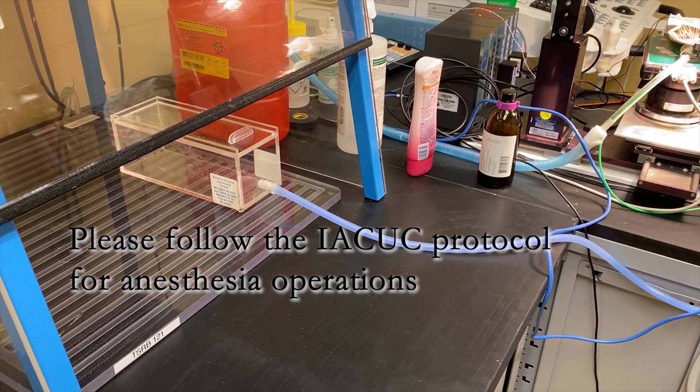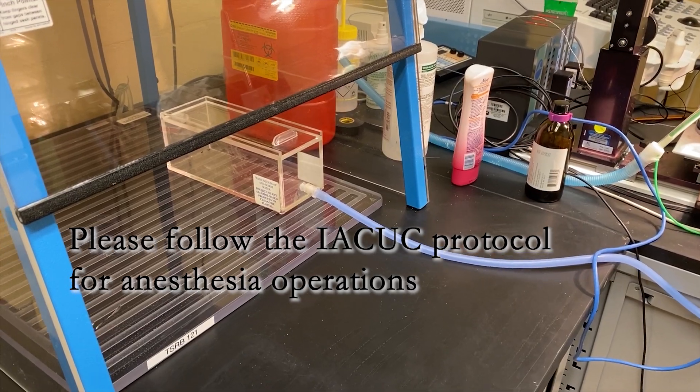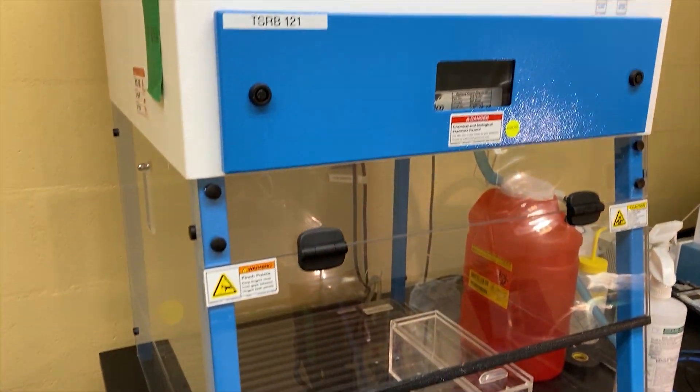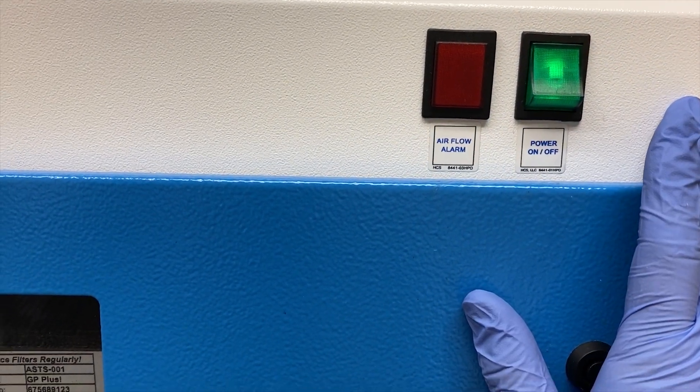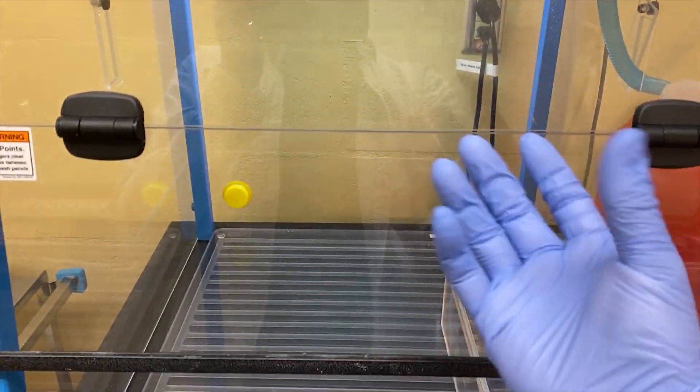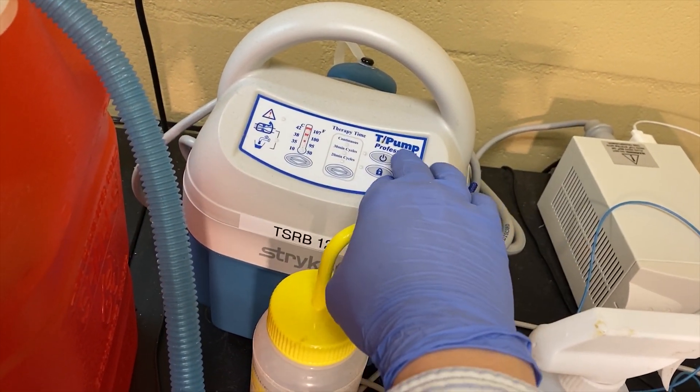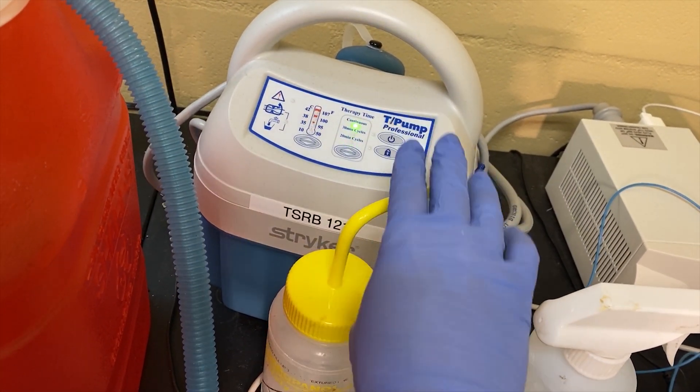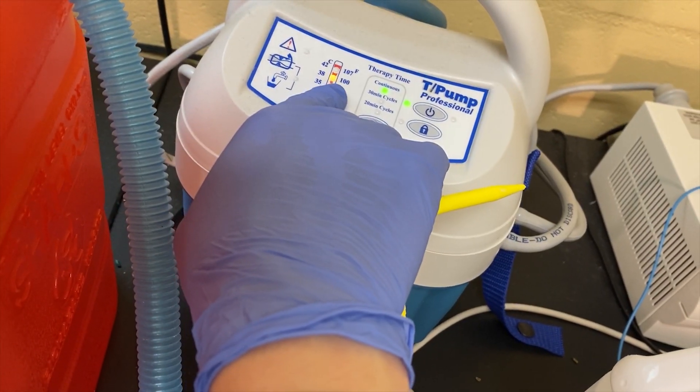Next, I will introduce the anesthesia device for mice. First, you need to open this device here, open it, and the light will turn on. And open the warmer. Be careful, temperature is 100.